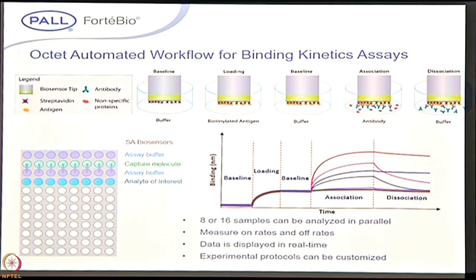the sensor dips into that well, and you can see the loading response. As I mentioned, some molecules go onto the sensor surface, you can see the change, right? The phase shift. So you can see the loading response. When the same sensor moves back to the well containing a buffer, here just a baseline, there are no molecules binding, unbound molecules get washed off here. The sensor next moves to the well containing the analyte, you can see the response. And the same sensor goes back to the well containing a buffer, bound analyte gets washed off. Very simple to operate this experiment.